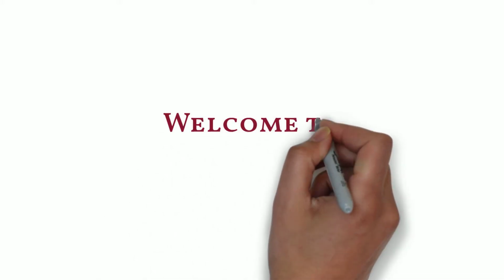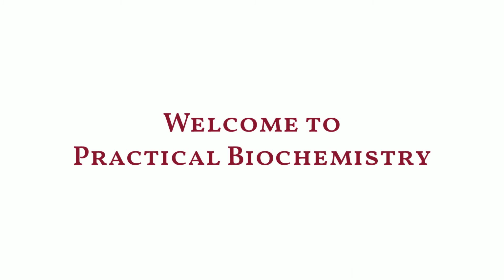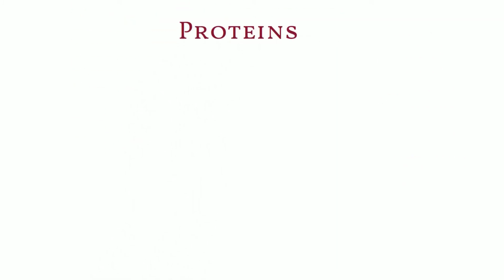Welcome to Practical Biochemistry. Today we are going to perform a test for identification of proteins in a given sample. First of all, let's talk about proteins.